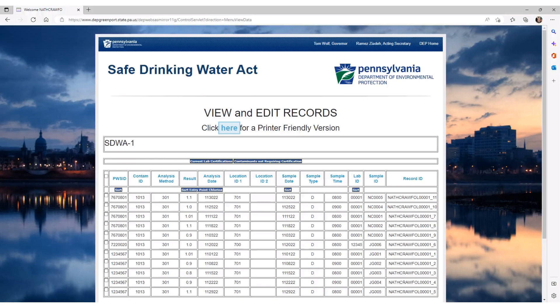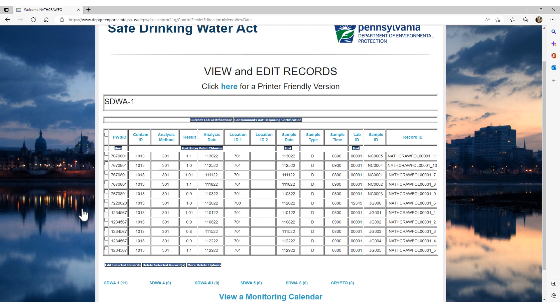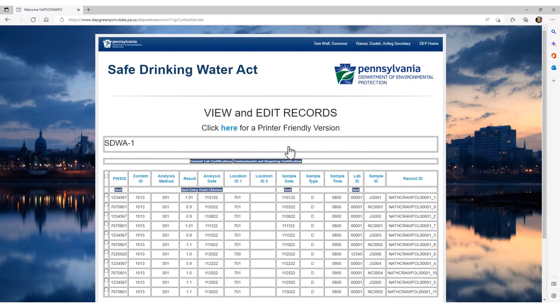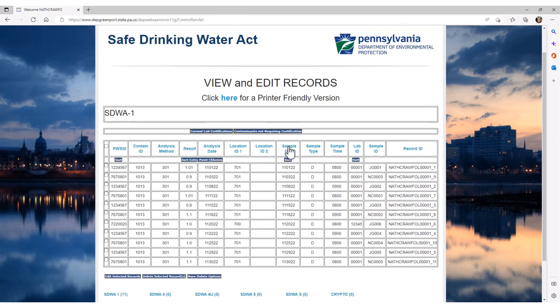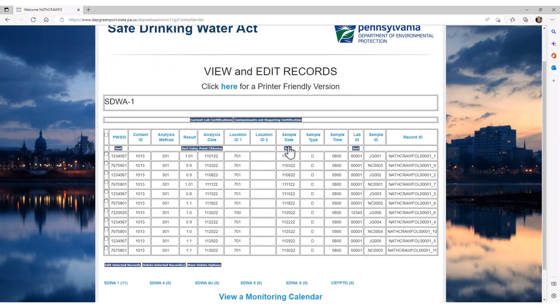Remember to check your results as an error message may not generate for this field. For example, if you misplace a decimal point or mistakenly add an extra digit. You can sort the records by any column which has a sort button, which are the PWS ID, Entry Point, Sample Date, and Laboratory ID. For our example, we want to make sure that we have entered all of our records and not duplicated any records. So we will sort by the sample date. Now we can see that all of the records have been sorted by sample date with the earliest at the top of the table.